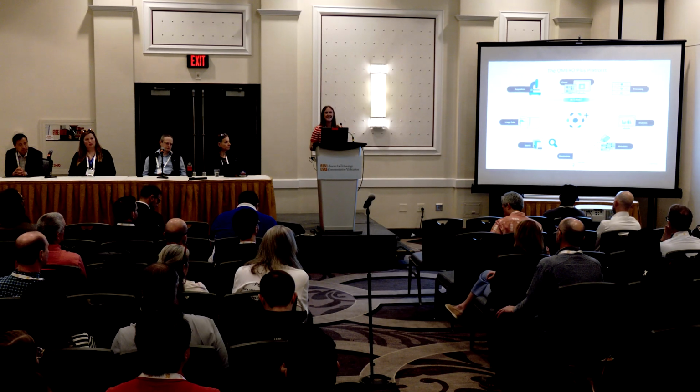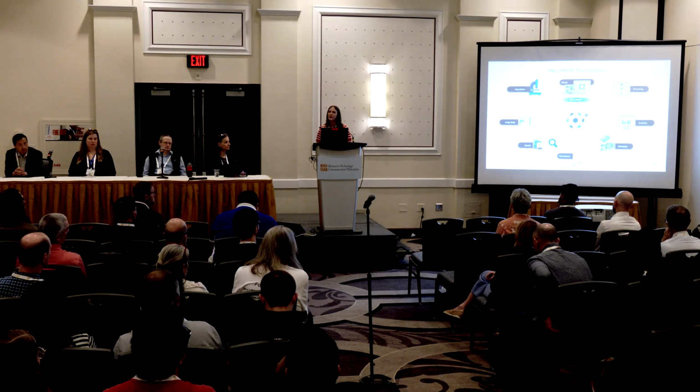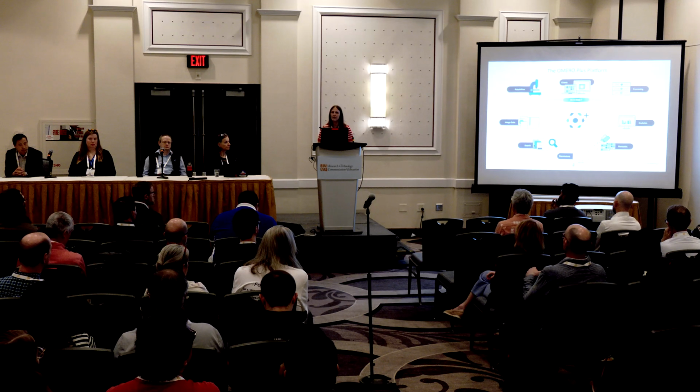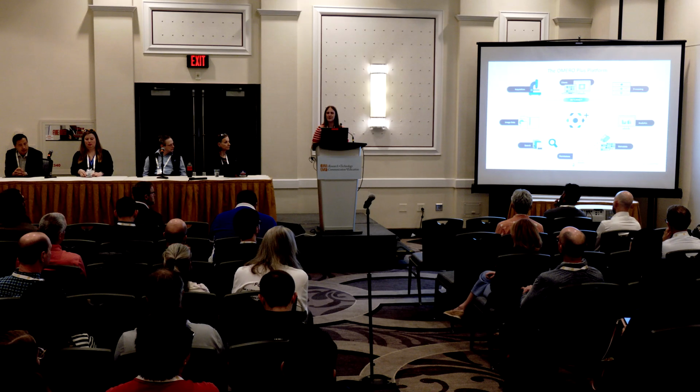You can't just double click on a file and take a look at your images anymore. You may need to be on a particular workstation with the right software installed. It needs to be powerful enough to be able to actually read and load that image data. It needs to be the place where you downloaded the image data to. If you need to go to this other workstation, now you need to download the files there as well. So it makes it really challenging just to interact with image data in the first place.